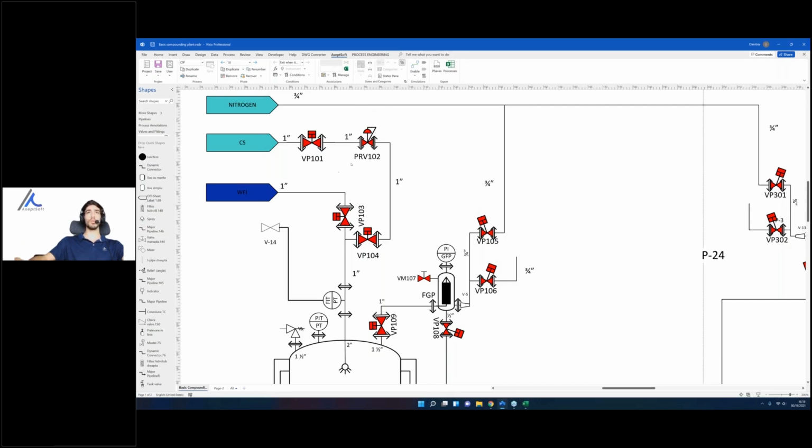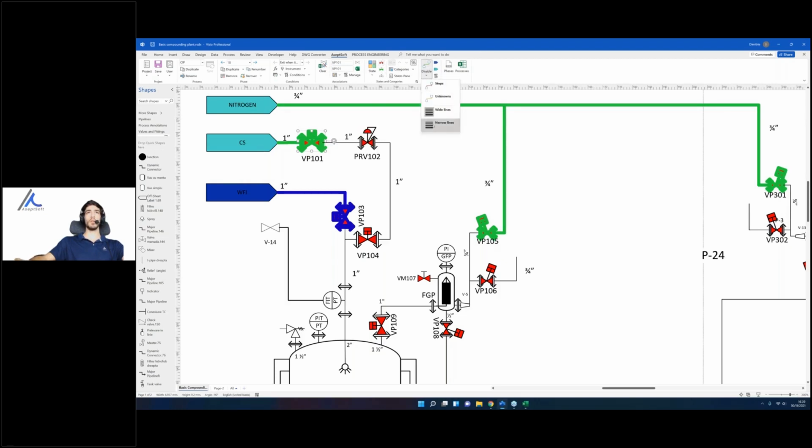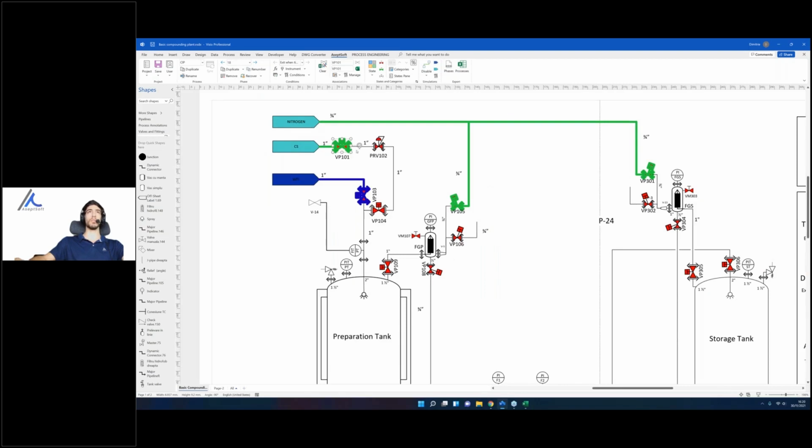Now, once we have done this and we have set the states of all the valves, Aceptsoft needs no other information in order to automatically draw the fluid stream simulation. So all you have to do is to press one button, enable, which is live. So as I open this valve, it will go further. And as I close it back, it will stop. Of course, we have some aesthetical changes we can apply, but I will keep them very big, the fluid stream, such that it is going to be very clear for now.